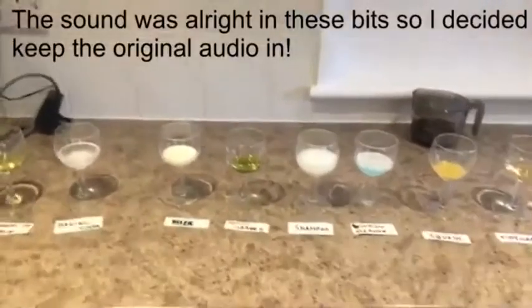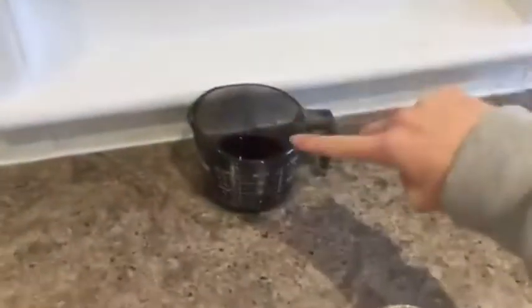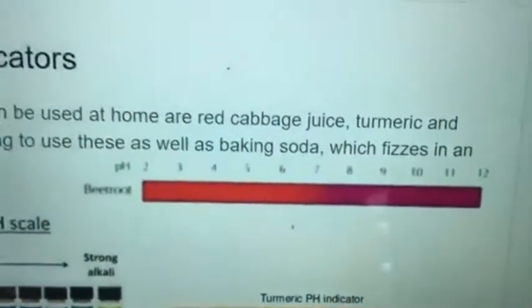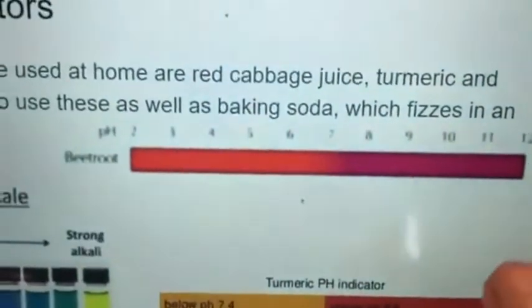Okay, so we've got all of the liquids back, and baking powder, well, soda. And this time I'm going to be doing beetroot. So this is what the beetroot will look like. So it goes more red when it's an acid and more purple when it's an alkali. And then this is what they look like.